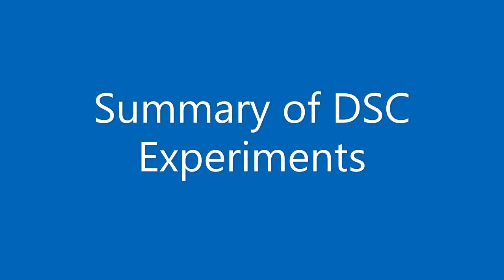Once again, these DSC experiments are carried out for all of the 6 known samples in this experiment. And the DSC data is being provided as well in the form of Excel files for this lab report.